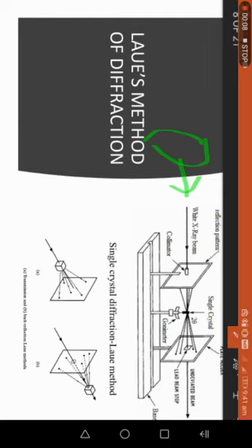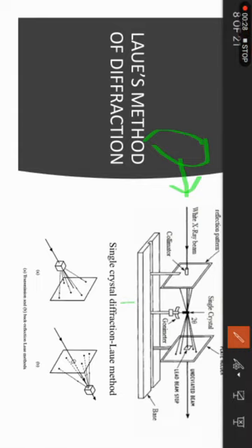When this beam passes through the single crystal, it may either deviate from the crystal due to the interplanar spacing, or get reflected back, or pass undeviated. For the undeviated part, we have a hole which lets those undeviated X-ray beams out, and the diffracted part falls on a photographic film, which creates a pattern, and the reflected back beams also create a pattern, the reflection pattern.